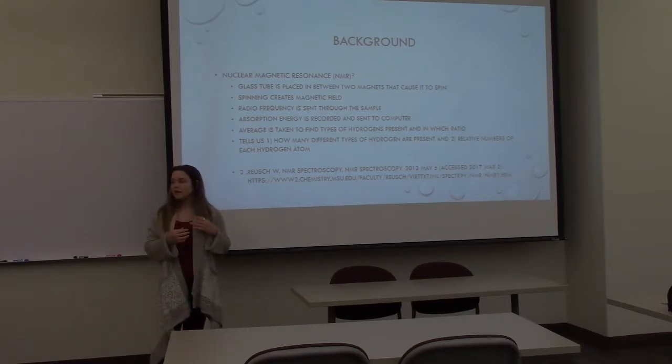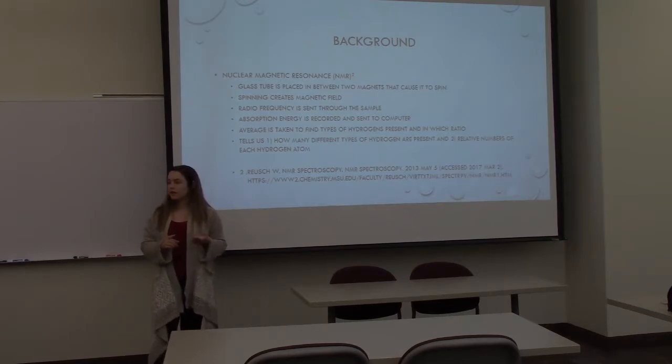And what the NMR is actually measuring is the amount of hydrogens present in that compound and the ratio of the hydrogens that are present. So the goal of the NMR is to tell us how many different types of hydrogens are present and the ratio in which they're present to each other according to range.